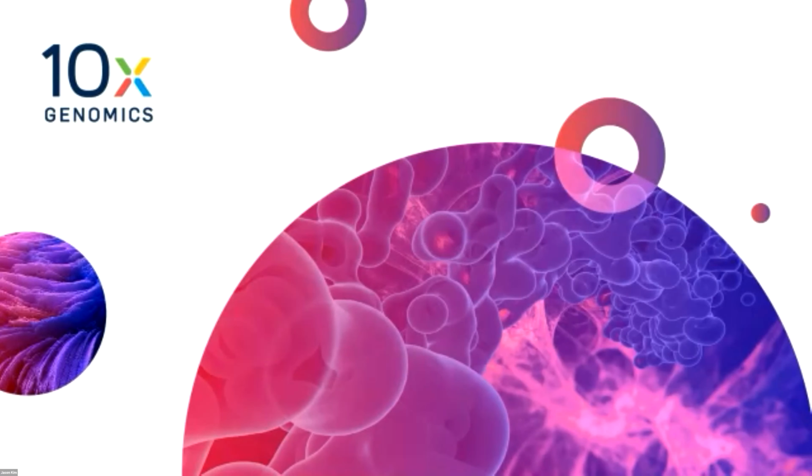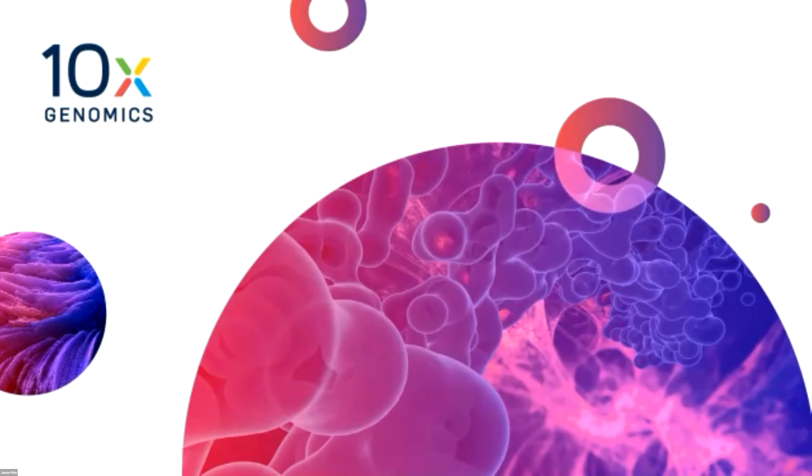I had a couple of questions. So presumably with this slide format, we could put multiple pieces of tissue on one area of a slide to decrease the cost per sample. Is that right? That is correct. There are actually a couple of papers that did that, where they took, I think, mouse spinal cord sections, and I think they did 4 or 5 on a section. So it's almost like a very small tissue microarray, more in a brute force sense. And yes, absolutely, there's no additional need, because the spots almost act as a sample barcode, because of where they are located. So there's not really much by way of deconvolution needed in the data either.